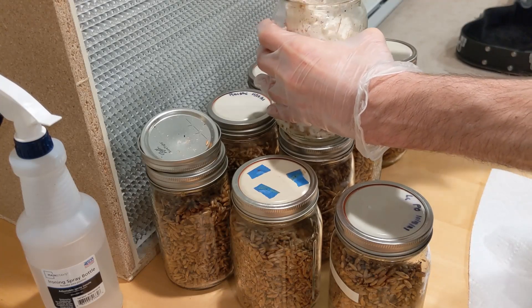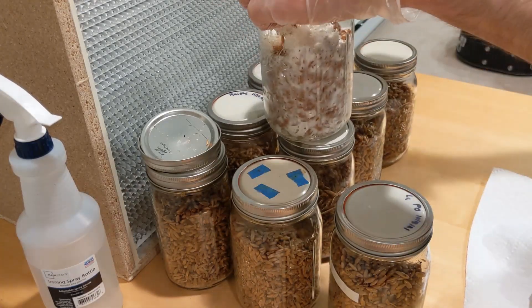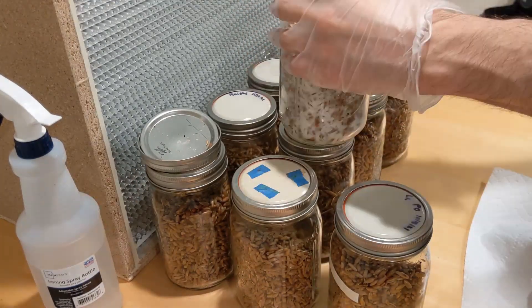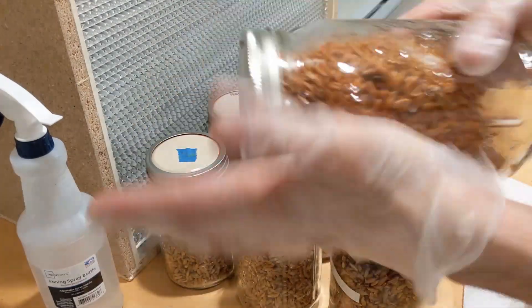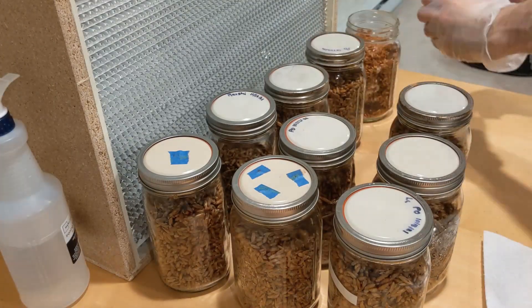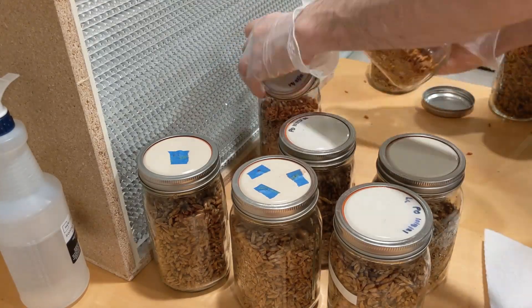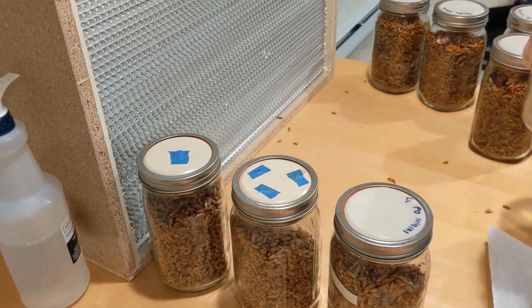I unload the pressure cooker and give my jars a nice little shake. The reason for the shake is to make sure none of the grains are sticking together, making it easier when I introduce the spawn — just shake everything through so we don't have any clumps. I'm also going to remove the lines means fruit at the top of my jars. I don't want to introduce any fruiting body to the spawn because that can create problems — bacteria, mold, maybe even fungus gnats — if I let my jars go a little too long.